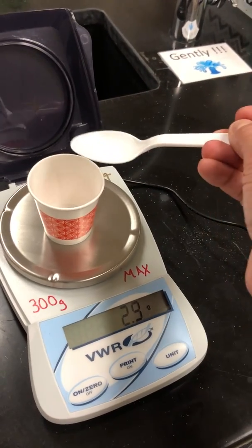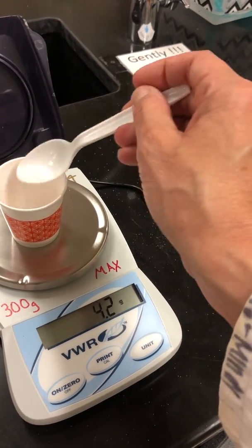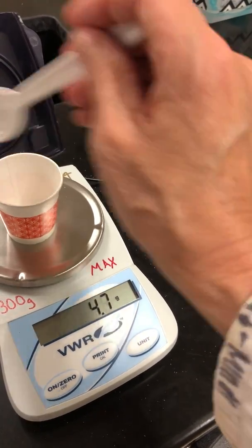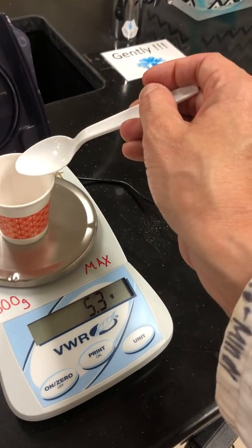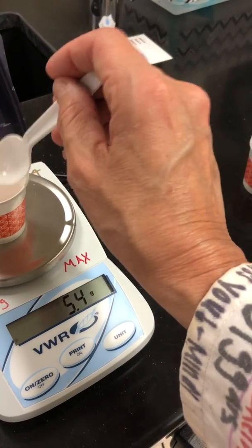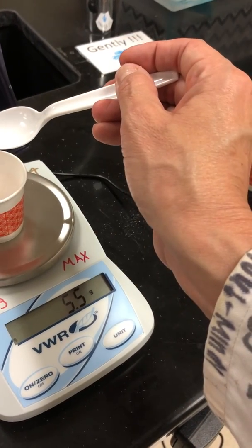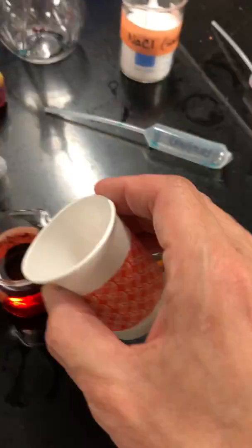This is not what's neat to know, kids. It's what you need to know. So let's get 5.5 grams of sugar. Yes. Does that feel good? Yes, it does. Okay, so let's get sugar in here.